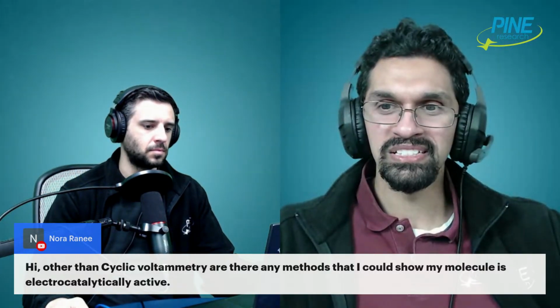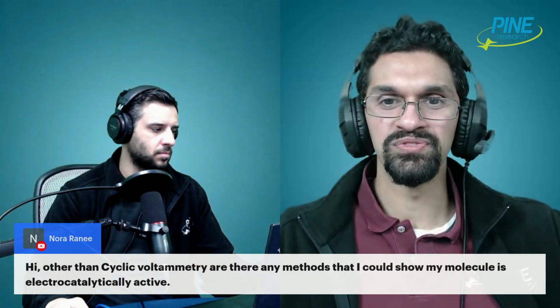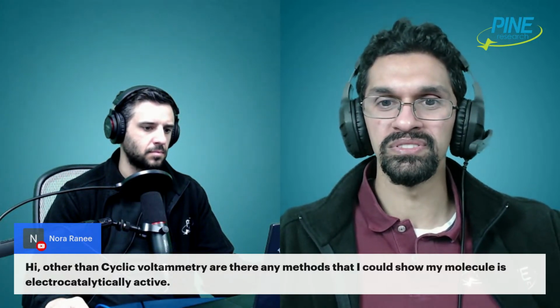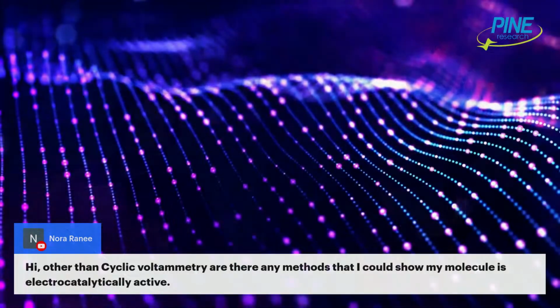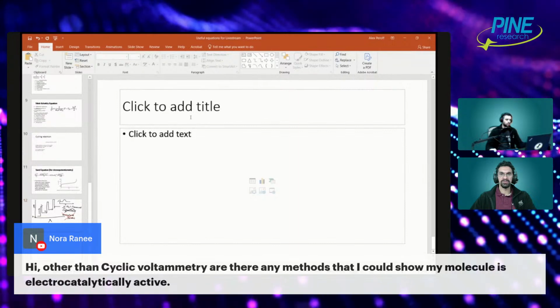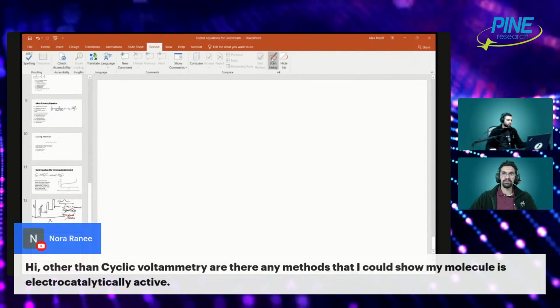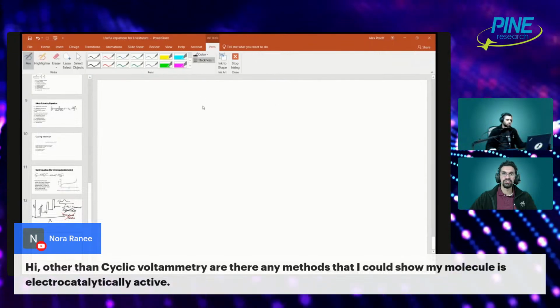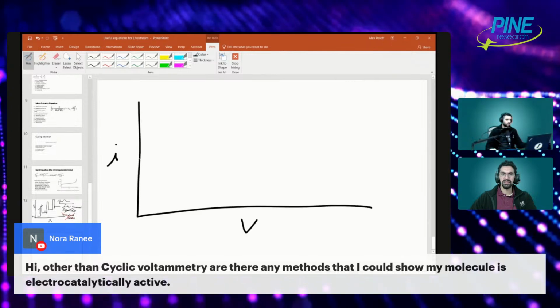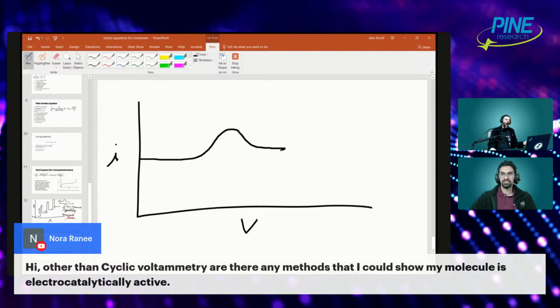Cyclic voltammetry is probably one of the best. It's very clear when you do cyclic voltammetry whether your system is electrocatalytically active or not. Just generally speaking, if I just show you, when you have a regular cyclic voltammogram, it's just two voltammograms. You have voltage, you have current. This is your CV under normal conditions.